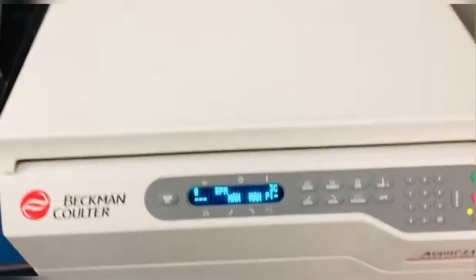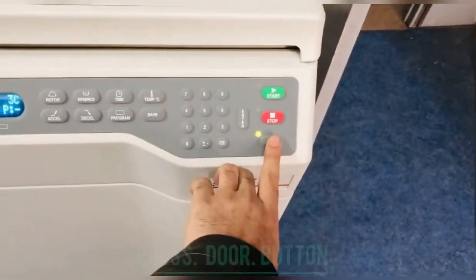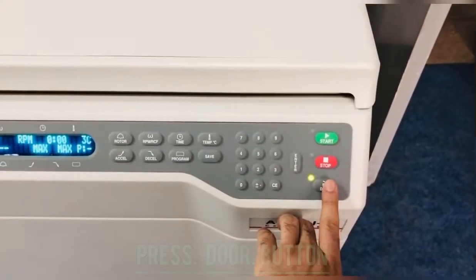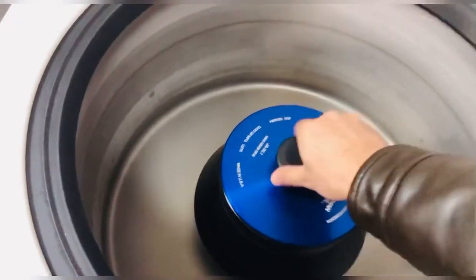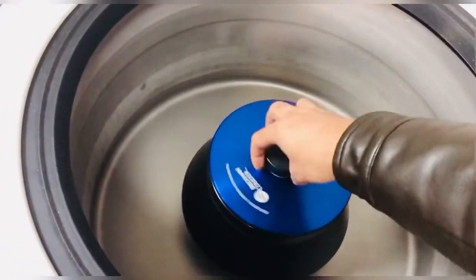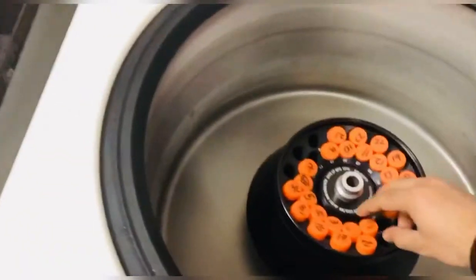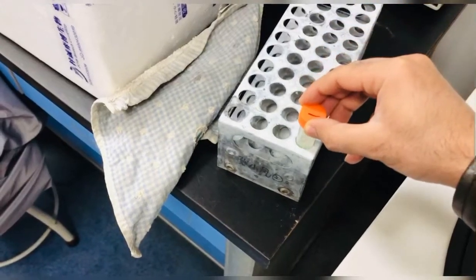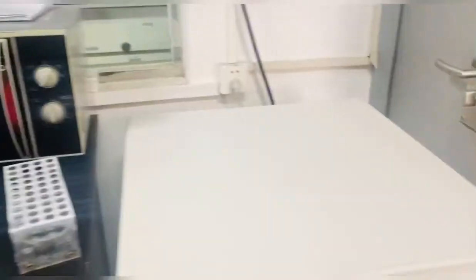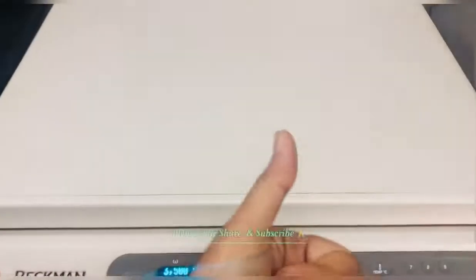So my samples are done. Press this button to open the door. Put your samples very carefully. Here is my lab, you can see.